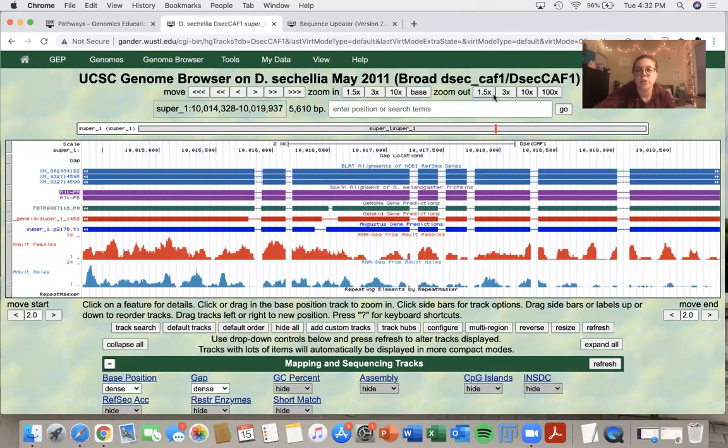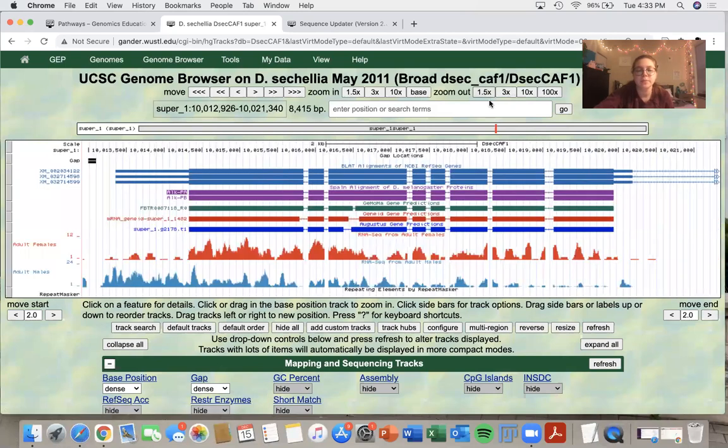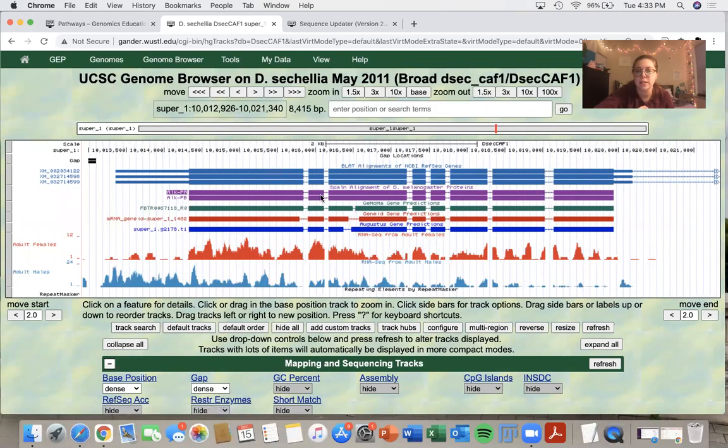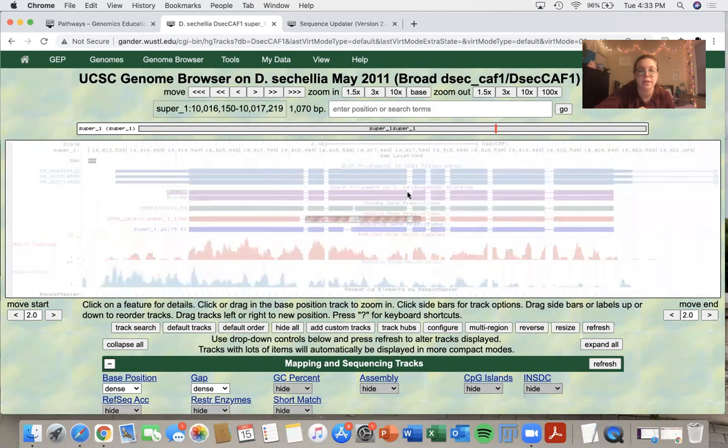I'm going to zoom out a little bit so I can see the entire gene. I see that the ALK gene contains eight exons and the region that I'm going to use today for the purposes of the sequence updater video is at the end of exon six.